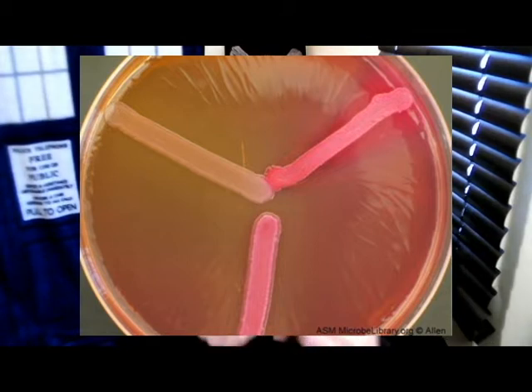If a bacteria is able to ferment lactose, the pH will drop, and as the pH drops, the red is absorbed by the bacteria. So the line that you streak will appear bright pink. So the bacteria that you streaked will be bright pink and be surrounded by a kind of darker color in the agar.